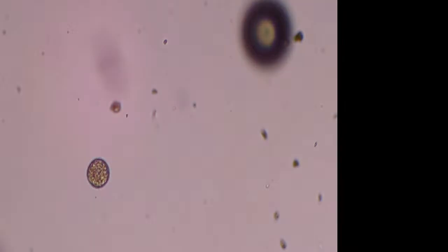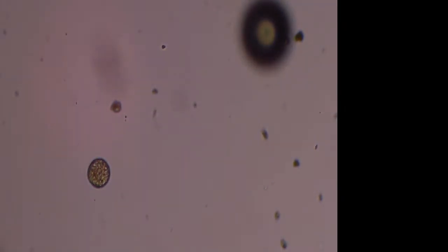Now it's the video game where I have to chase it around. Well, it looks like there's one in the center that's not doing anything. Same boat as that other one was, that's not too happy with this life. Cysted form where it's dormant because it was dry and just got water added to it.